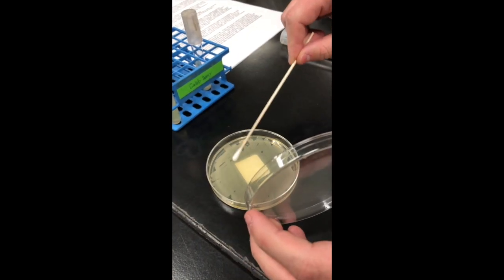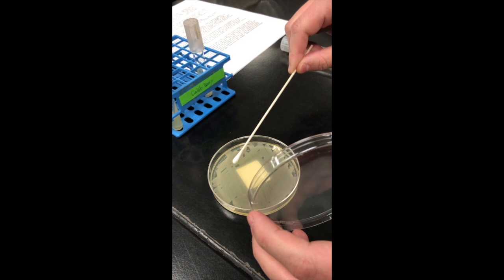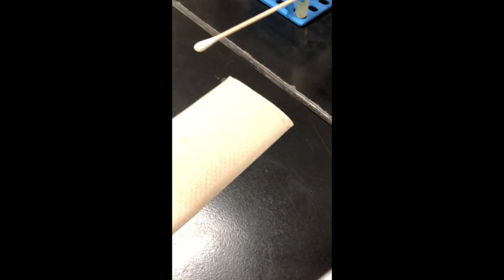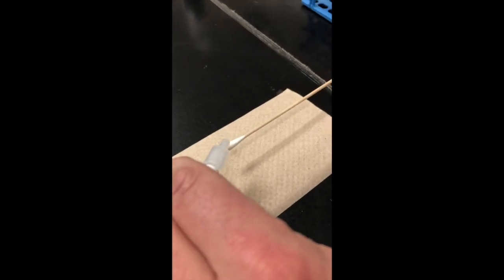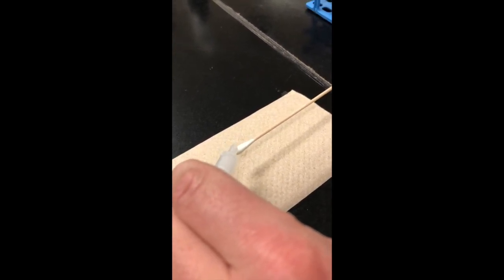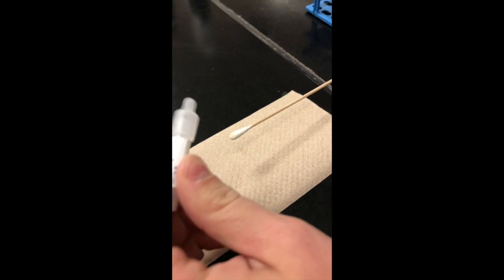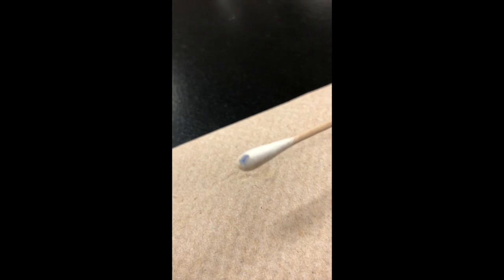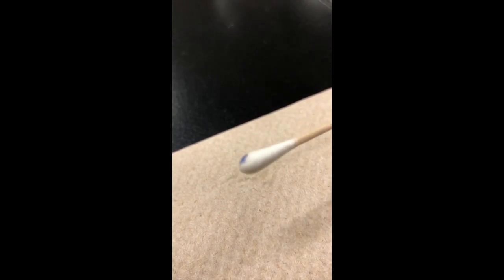So now we're going to do the Pseudomonas, and we just have a plate of Pseudomonas, so we're just going to pick up a couple of areas, and now we're going to add our cotton swab oxidase reagent and see what happens. Sometimes you squeeze a little bit. I might have got a little bit, but I'm not really sure. There we go. If you notice, with just a few seconds, we're already getting a nice blue color. So this tells me Pseudomonas has cytochrome C.